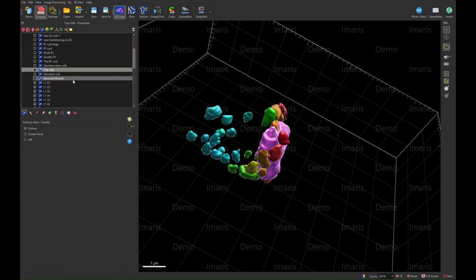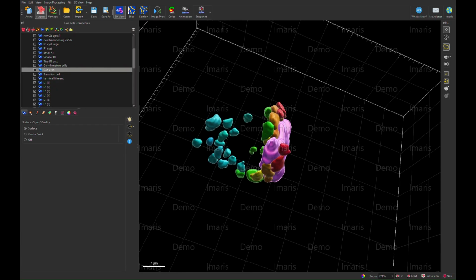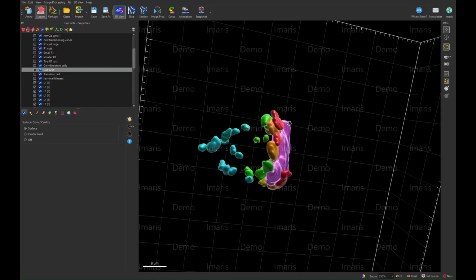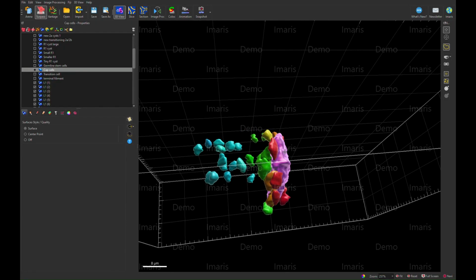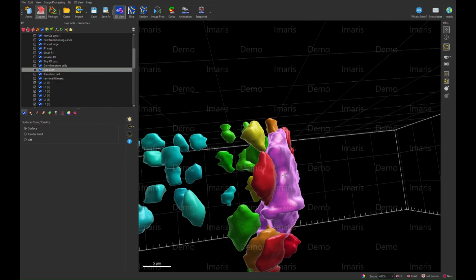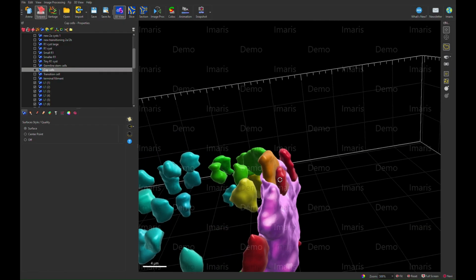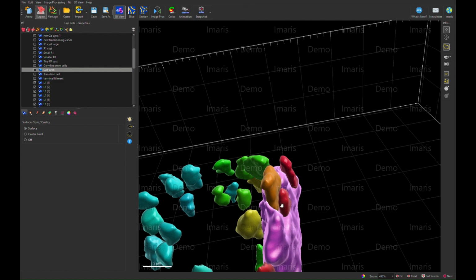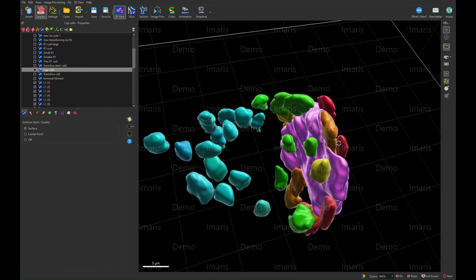Okay, so in pink is our 2B cyst, abutting the Fas3 border, surrounded by a ring of layer 1 red labeled follicle stem cells, and then a layer of orange layer 2 follicle stem cells, and lastly the yellow layer 3 follicle stem cells.